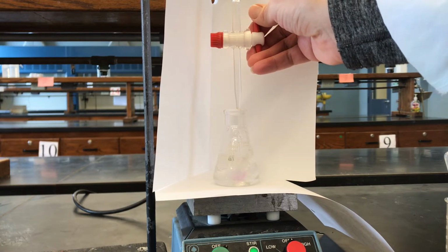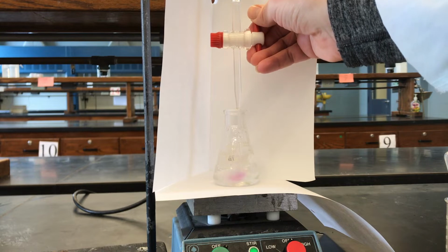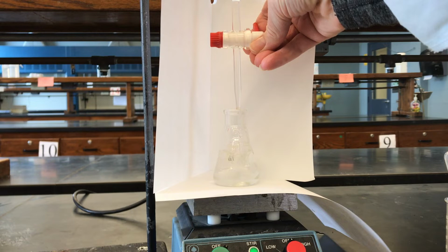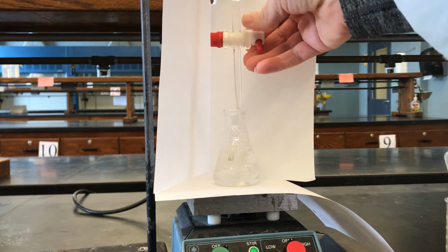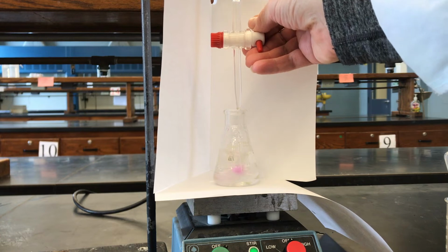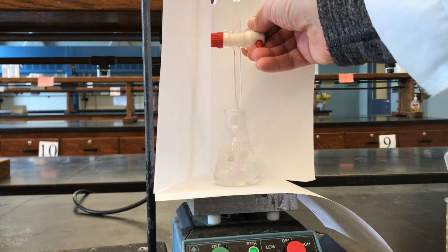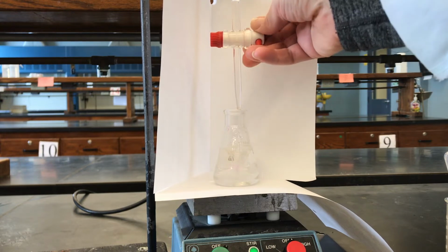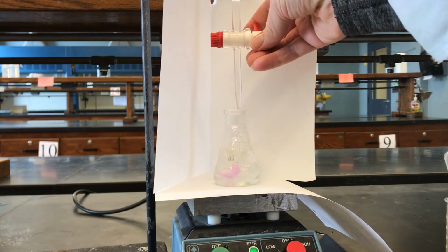So we go fast until we start to see some pink color appearing, and look, now we're starting to see some pink. So now I'm going to start slowing down, and you see the pink appearing and disappearing. And it's disappearing pretty fast, so I'm still dripping at a fairly fast rate, but soon I'm going to slow this down. Okay, it's starting to take longer to disappear, so I'm slowing it down a little bit.